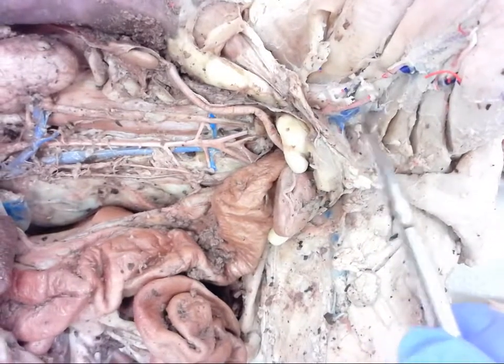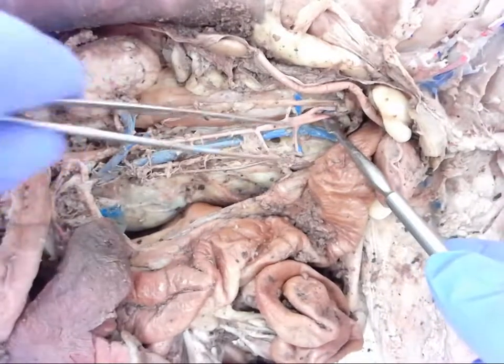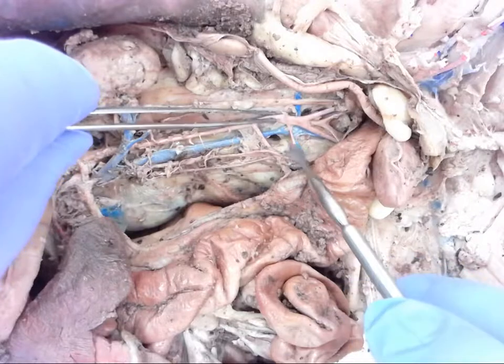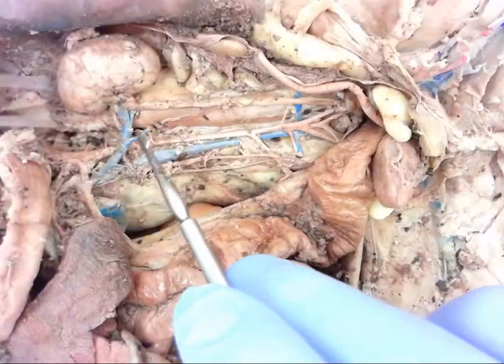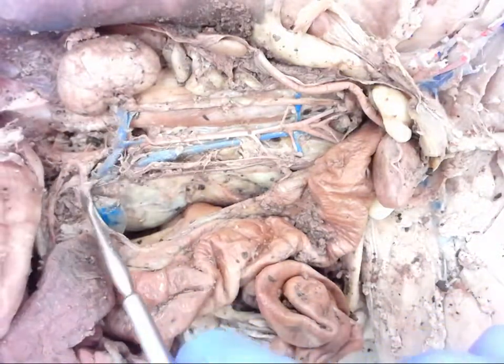Then coming back, femoral vein comes back and combines into the inferior vena cava. We have the iliolumbars joining. We have the renal coming back in as well as it feeds back up to the heart.